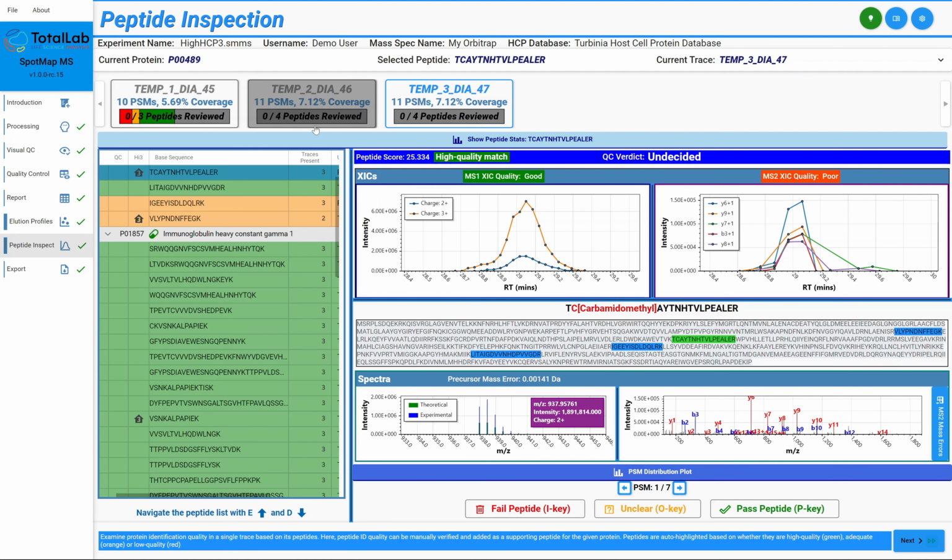And by looking at these columns, we can see, if 75% of it is rejected, we're going to reject those results. But if most of it is green, we know that actually the vast majority of peptide matches for the proteins that have been identified are true, are positive, based on whoever has been reviewing this data and their names on it. So you can always check back and see who's done this work, etc.